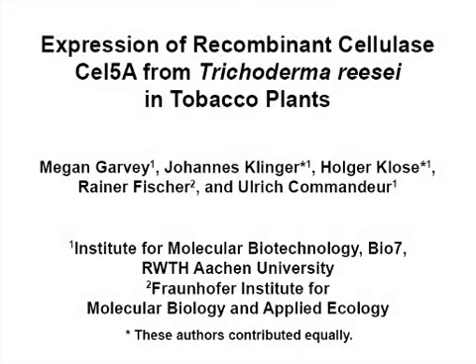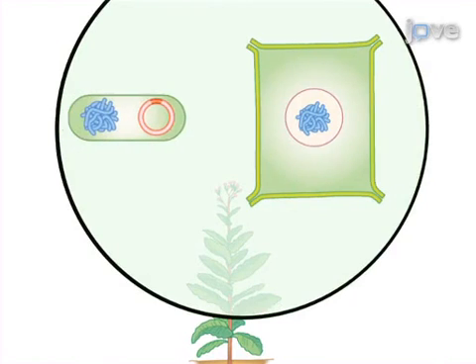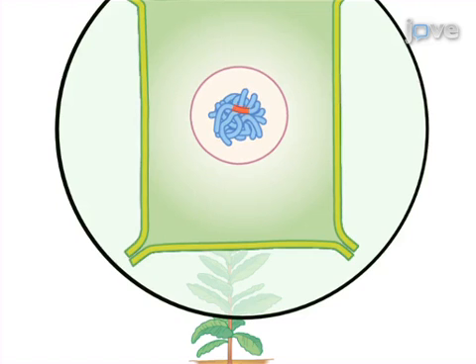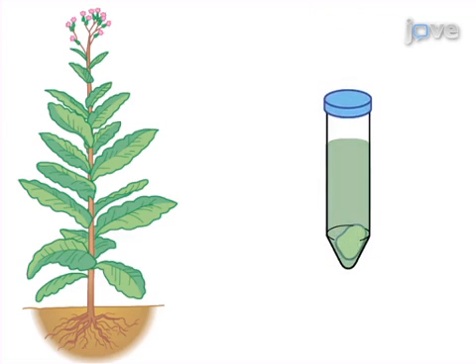The overall goal of the following experiment is to express target proteins transiently in tobacco to gain an idea about the feasibility of plant-based enzyme expression in a short time frame. This transient expression is achieved by infiltrating tobacco leaves with a strain of Agrobacterium tumefaciens, which contains a vector incorporating the gene of interest. As a second step, after incubation, infiltrated plant leaves are harvested and protein extracts are partially purified to obtain a working enzyme solution.